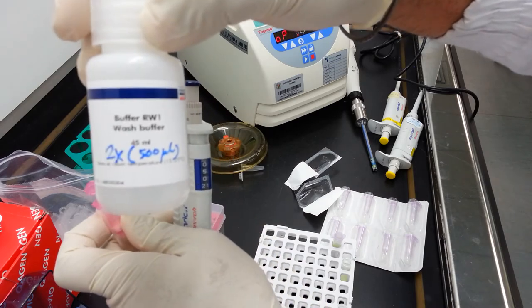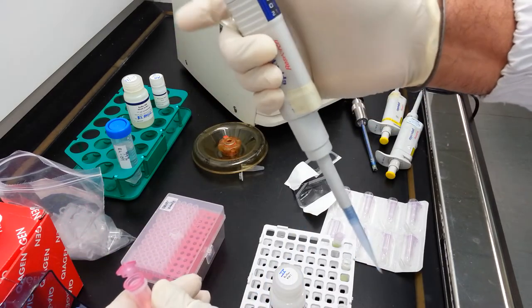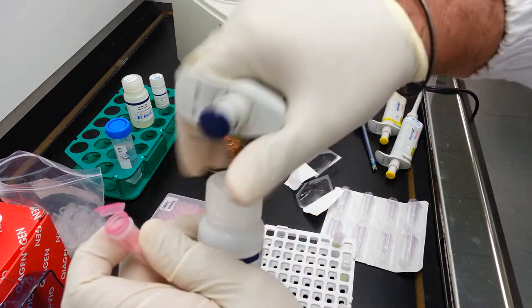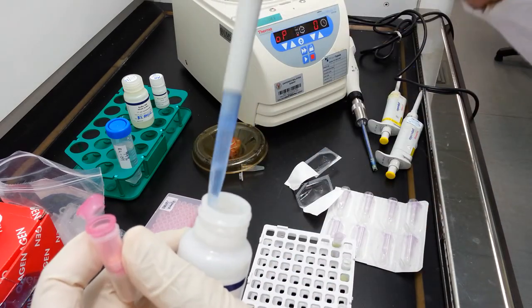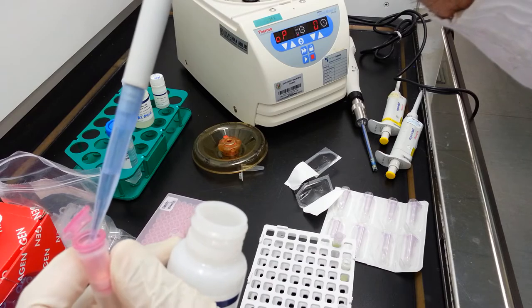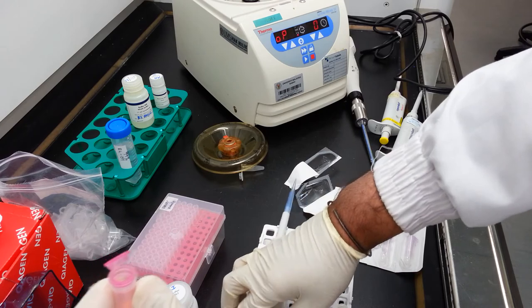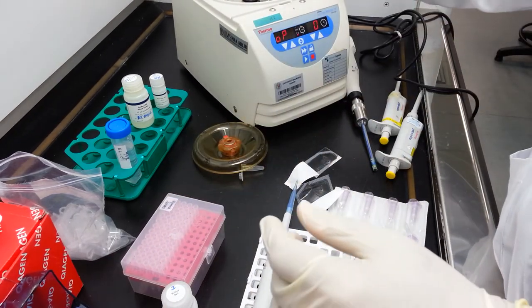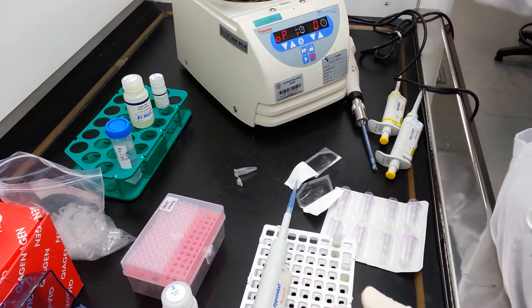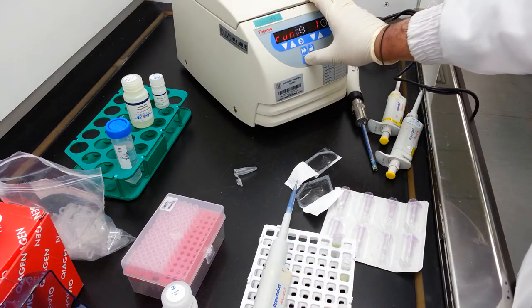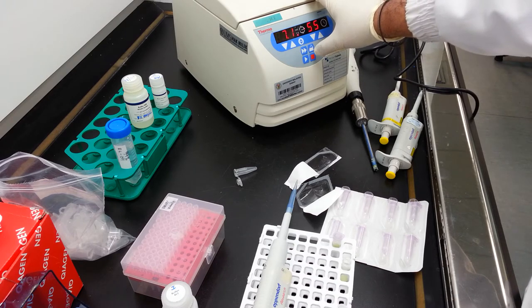This is buffer RW1. You need to transfer 500 microliters of buffer RW1 into the upper section of this tube. So we have RW1 here. Spin down briefly for 15 seconds at 13,000 G.